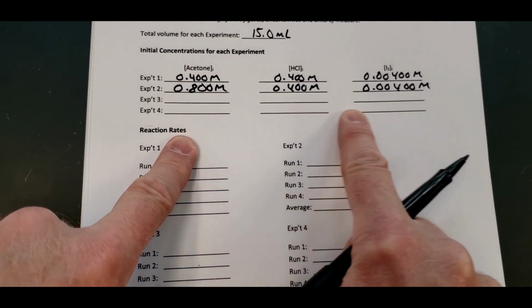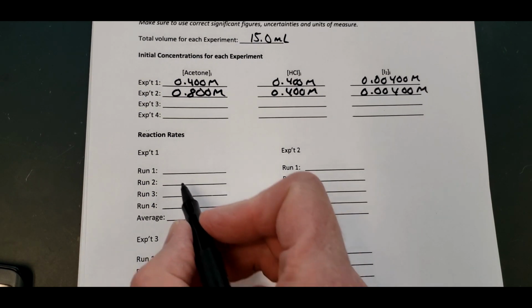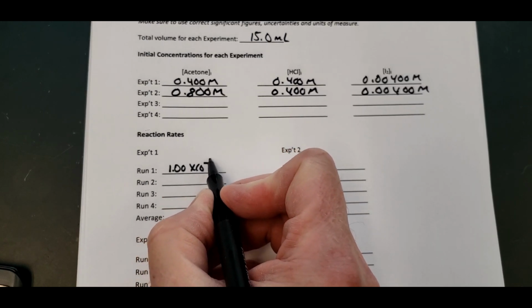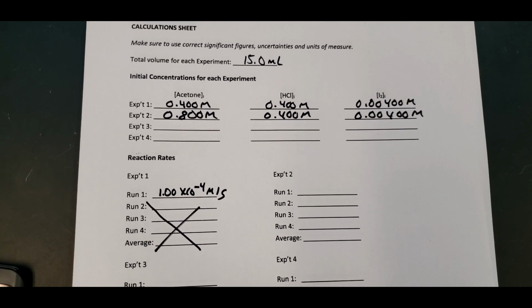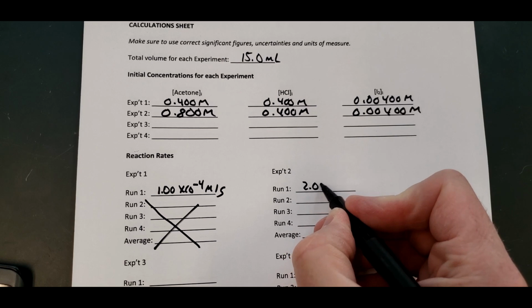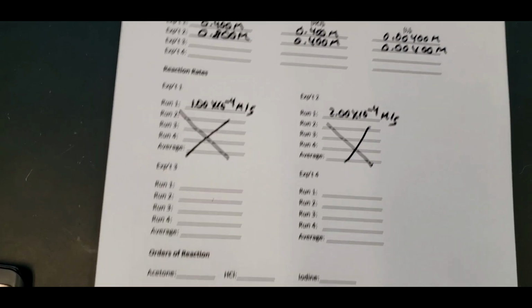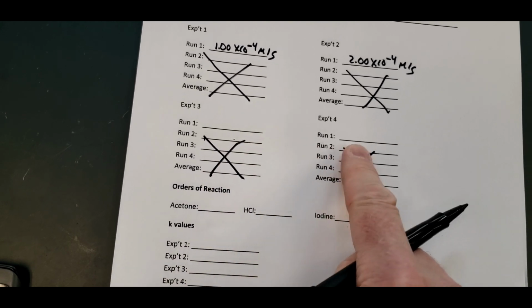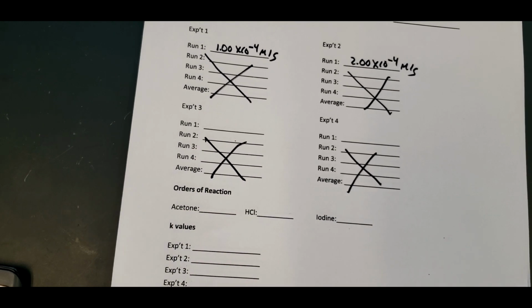So let's put these values into the sheet. I would need to finish this out. You should be doing that, but I'm just going to leave that. I'm just trying to show you how to do the basics here of each part. So this becomes this, and then we didn't do this, and we certainly didn't do the average. And then experiment 2, this should be here. And I'll leave you to do the top part. So you'll need to do this one and this one. So you'll use your concentrations we just found for experiment 3 and 4 for iodine and divide by the times for those experiments.